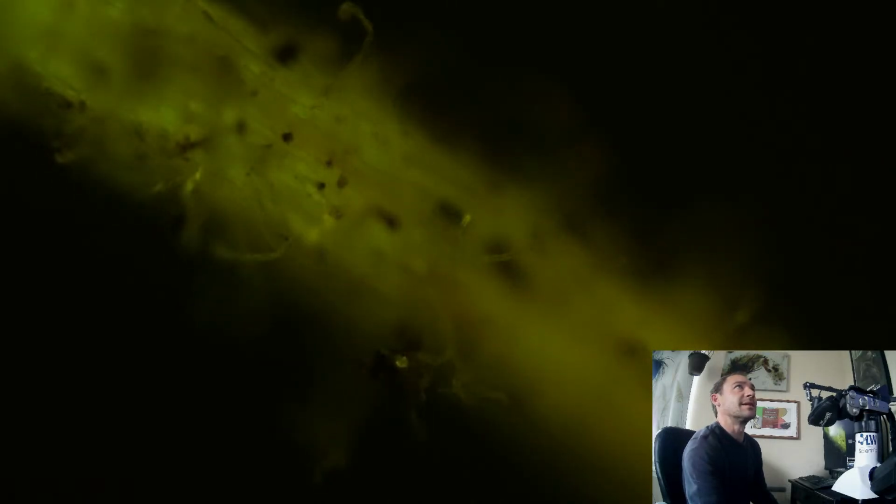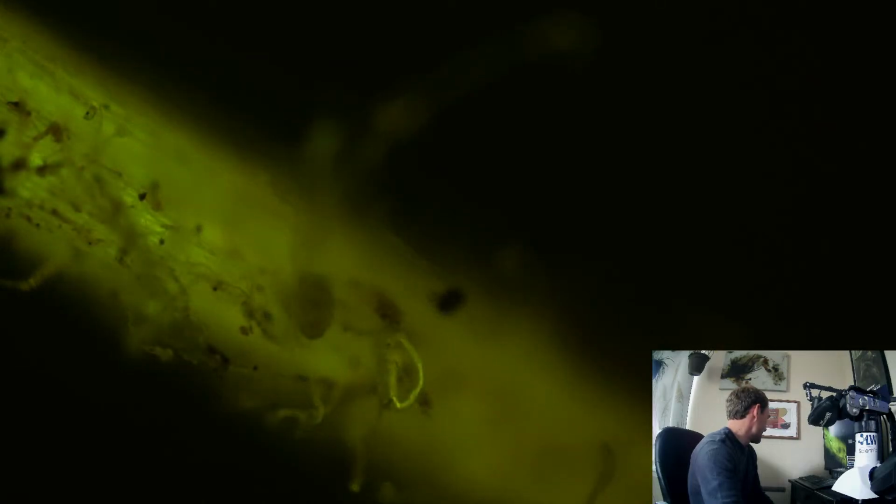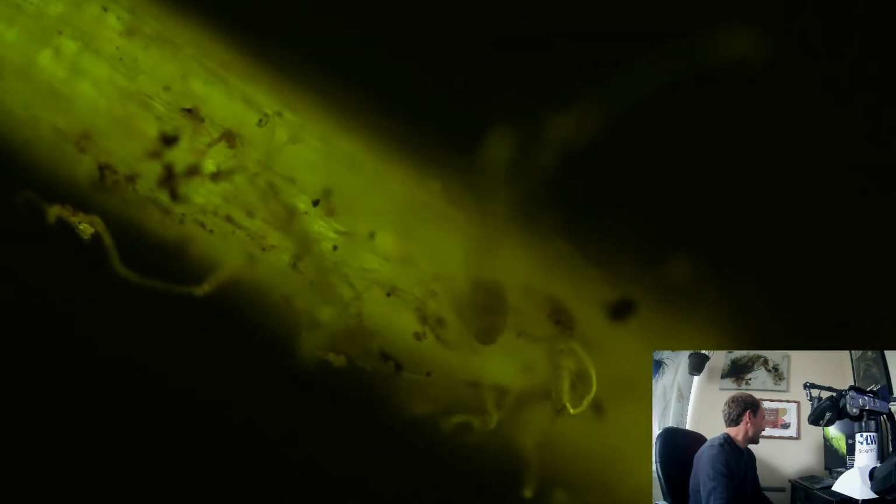Anyway, let's continue on looking down this dandelion root. We are at 100x magnification. And a whole lot of root hairs. It's a pretty bright glow in there. Let's see. All sorts of cool things. Yeah, it's hard to see.